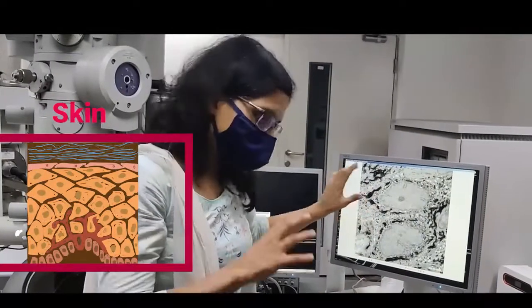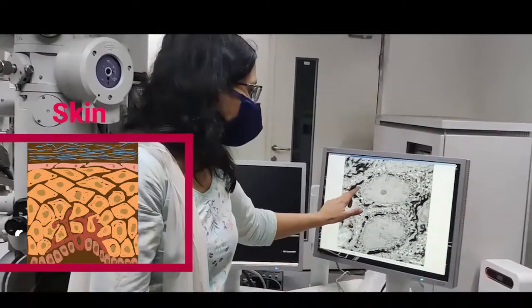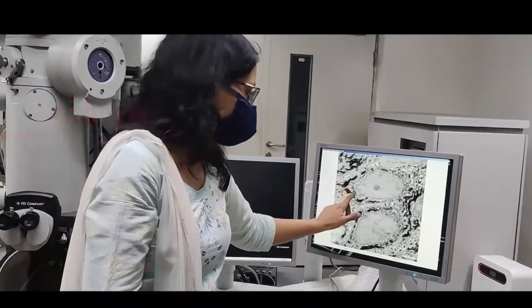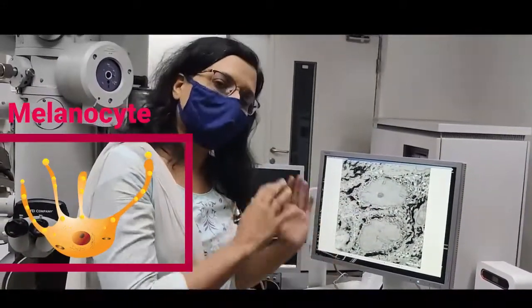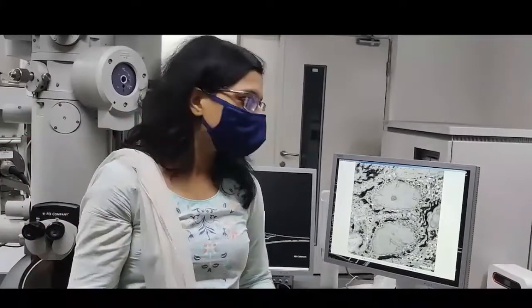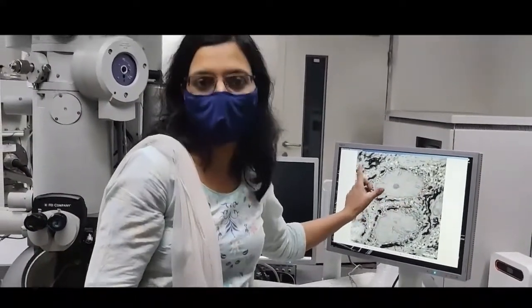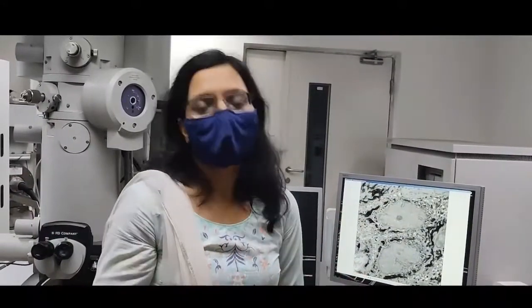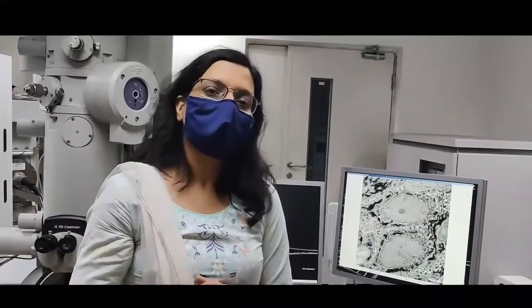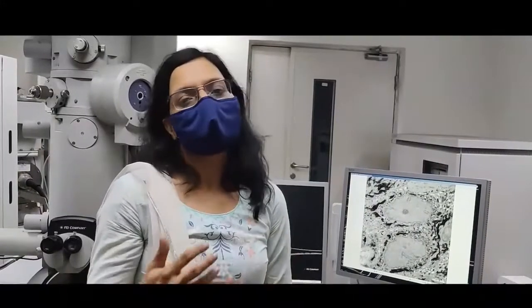This is the normal skin of a vitiligo patient and here the melanocytes, the melanin content is actually normal in the normal appearing skin. However, if you look at their vitiligo skin, you absolutely see zero melanin content in that. So, this is what we are trying to understand once the melanocytes are lost from these patient's body, what really happens to the other cell types.